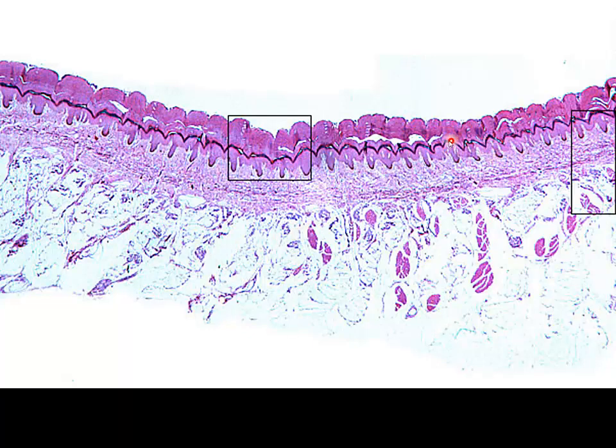The dark layer, I'm not sure if that is granulosal layer or not. That is difficult to see if that's going to be granulosum or some artifact of stain. We can see that as we look at higher magnification. But this is going to be our spinosum, granulosum, corneum, lucidum, and granulosum is here. I'm sorry, this is basal down here. This will be dermis, papillary layer, reticular layer of dermis, and hypodermis down here.